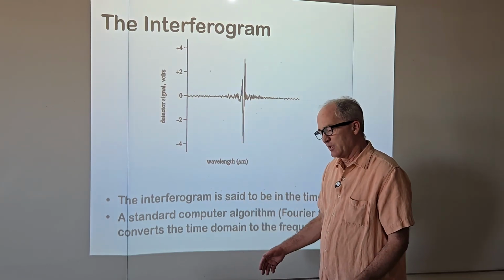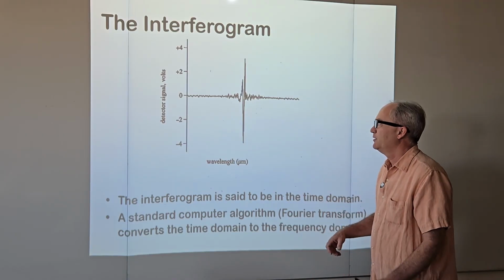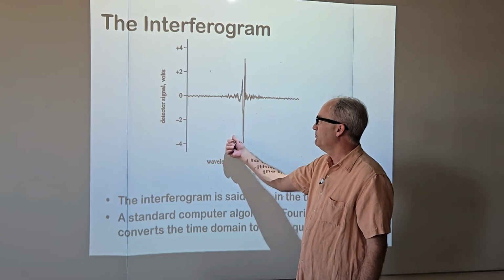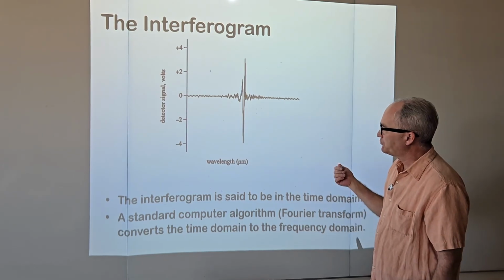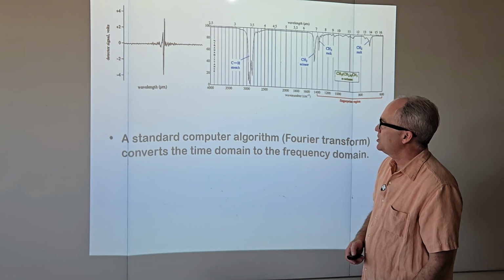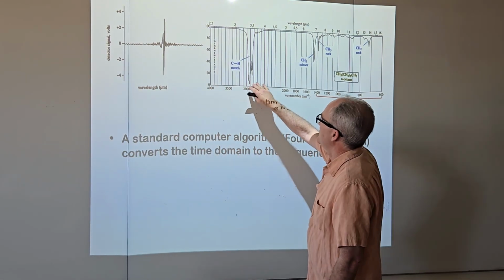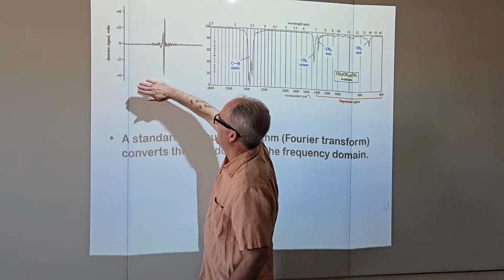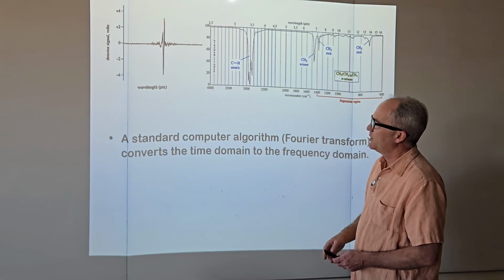You put your sample in the spectrometer and it takes a snapshot. Here is the absorbance event, this is time, and this is absorbance. If we take this, well, I better not lie to you, it says wavelength. It gets changed into frequency. So this signal gets changed into something like this, converting the time domain. Imagine that's not there. We'll look at it more in the NMR chapter.